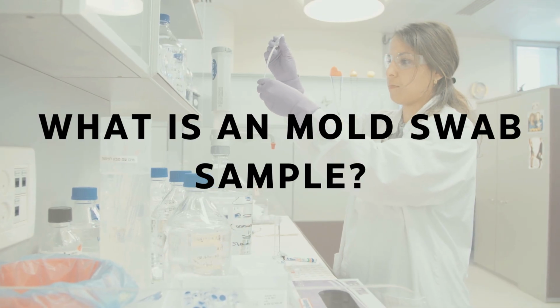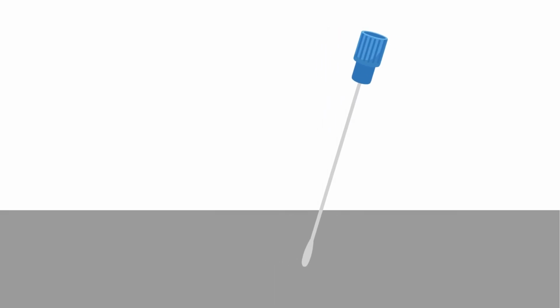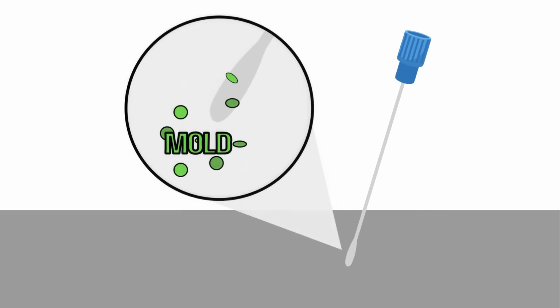What is a swab sample? In some cases, we also take a swab sample. This is used when visible discoloration, staining, or suspected mold is found on a surface like drywall, baseboards, or AC vents. We collect the sample with a sterile swab, send it to the lab, and they test it to determine what type of mold, if any, is present.